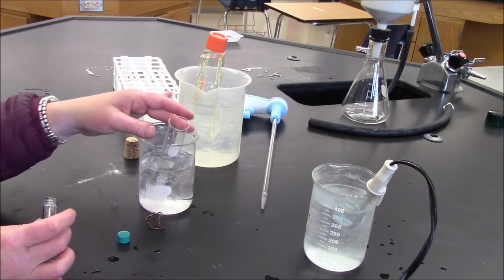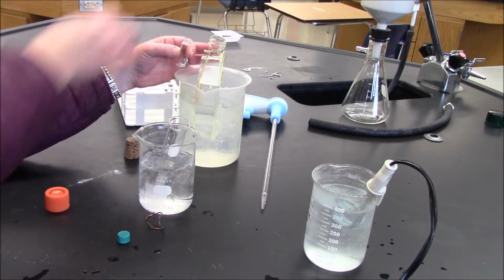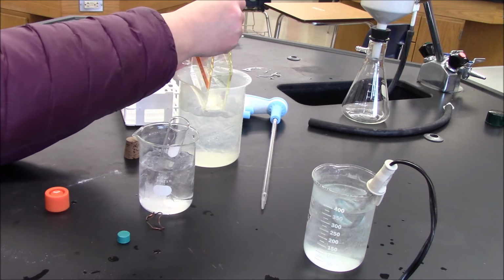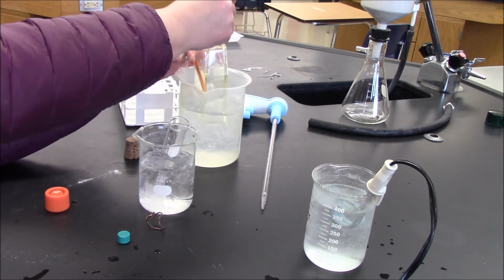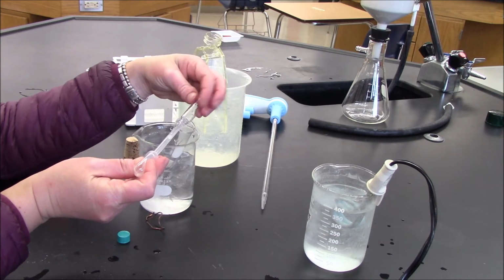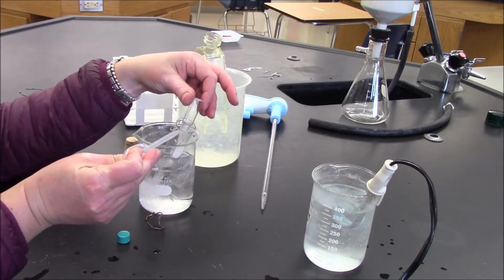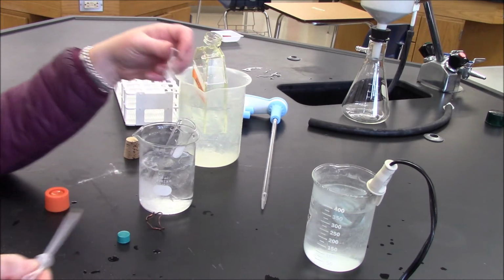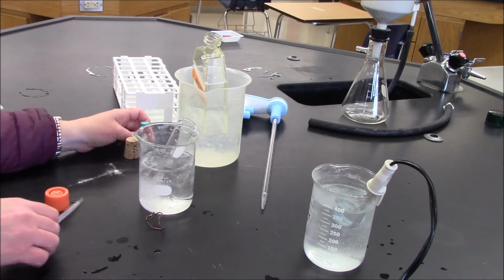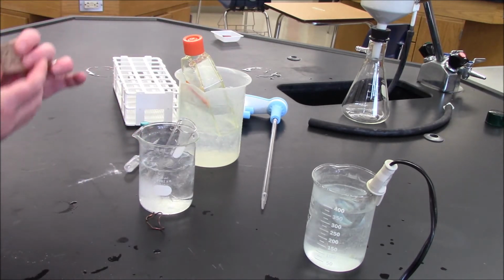They're asking me now to rinse my reaction vial with some cold water, so we'll do that. Now I'm asked to cap the test tube and shake.